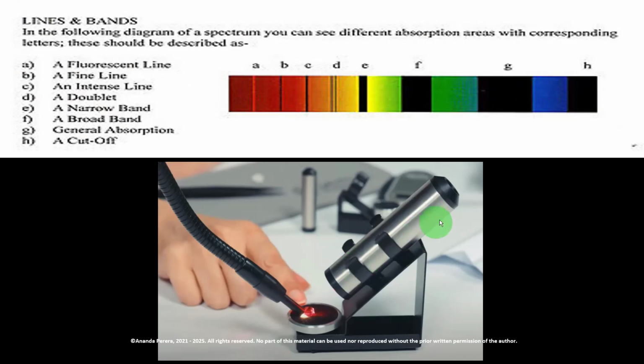This is the spectroscope. There is a stand, but we can see this easily by hand, without a stand. We can use our phone torch, and stick the stone to the phone flashlight, and you have to cover the area between the stone and the flashlight.